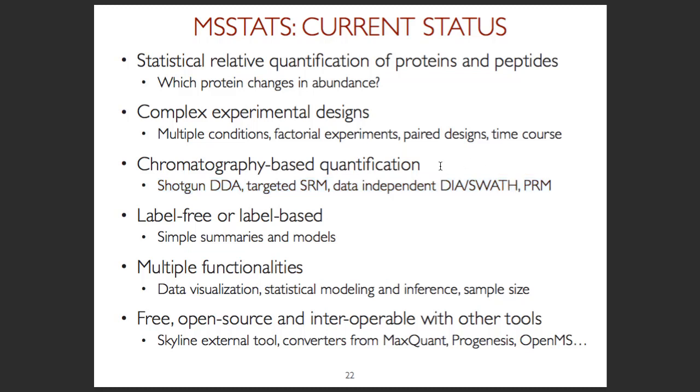However, this time, I think tomorrow we will, for the first time, try to present our pilot work with TMT to show how we can also work with the TMT labeling within the MSstats framework. It's the first time we present it ever, so be patient with us, but I hope it will be useful, and we also hope to hear your feedback on that. But for today, it is label-free or label-based, and it has multiple functionalities.